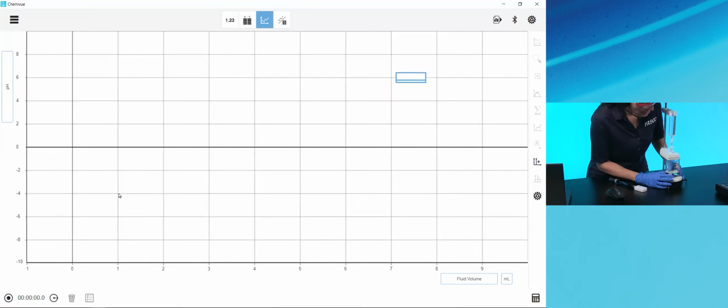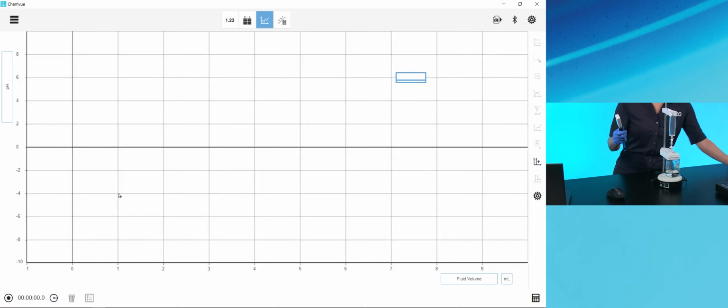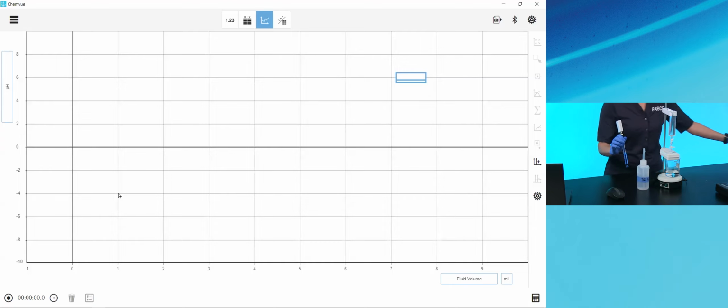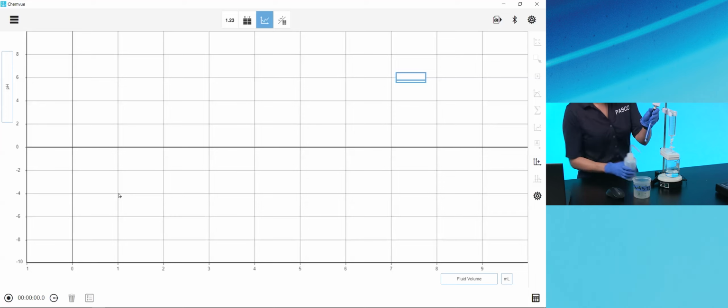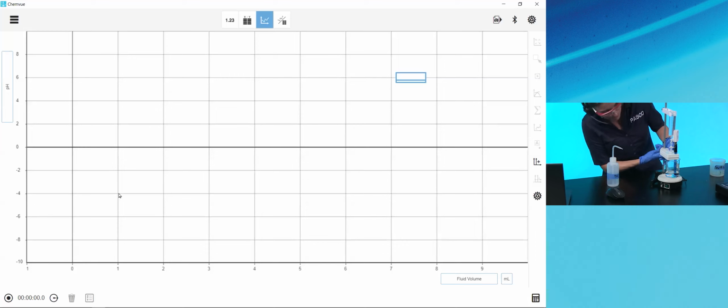Now I've got my magnetic stirrer set up here, and I have to put my pH sensor into the drop counter right here, move the storage container, and rinse the probe before I do that. I'm not concerned about adding additional distilled water in there since it's already dilute anyway. I want to make sure that when I put that sensor into the beaker, the bottom of the sensor is not touching the bottom of the beaker. It's actually touching the bottom of the beaker, so I've got to raise things up a bit, a little higher.